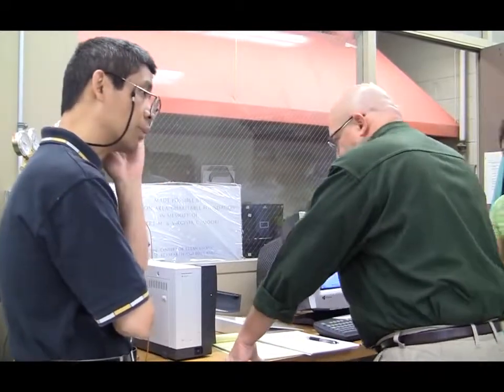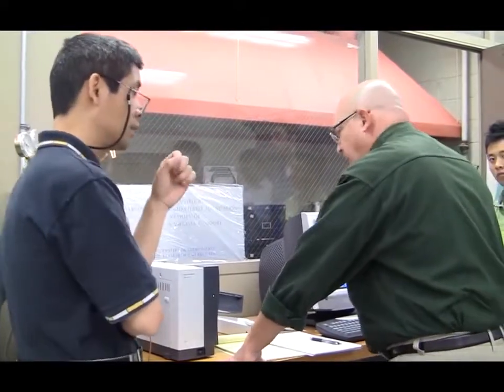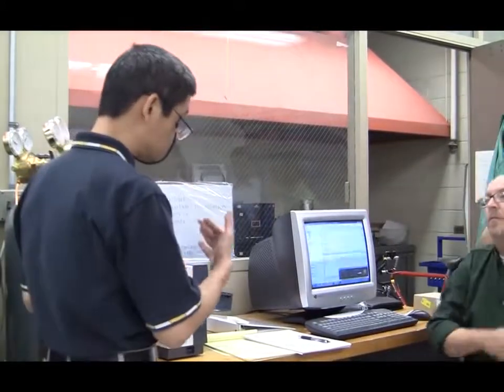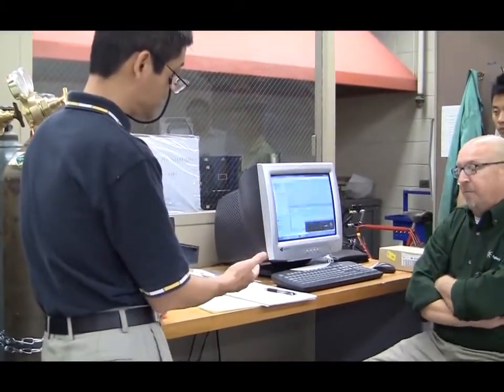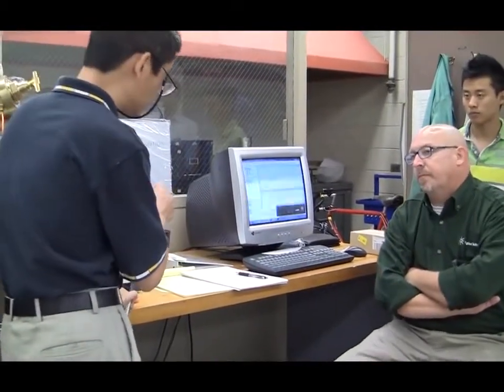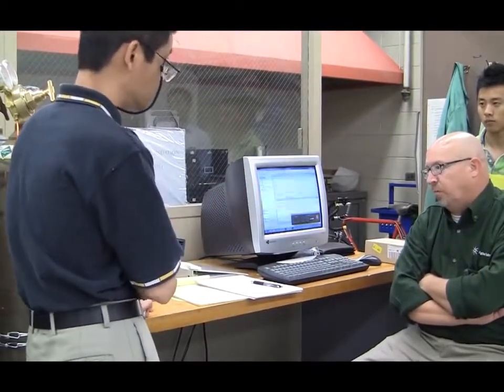It looks like we can do a more detailed training after the video session. For the video session, I would suggest you walk us through the process of method building, and then run the data analysis. Okay, you can use air. That's what we'll do. We'll run air right now.